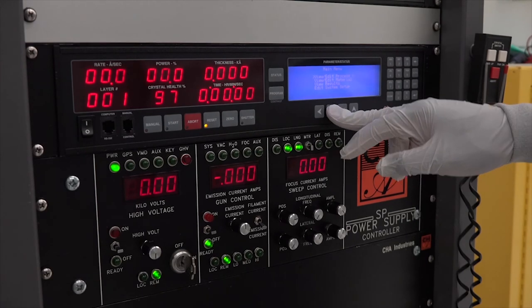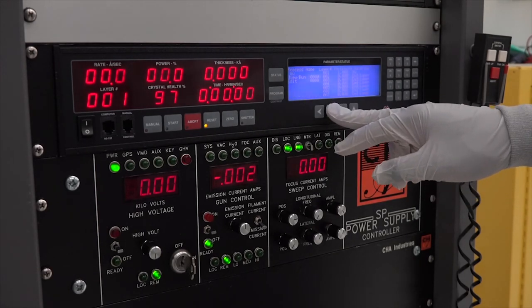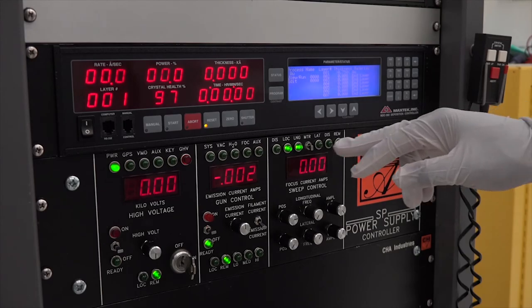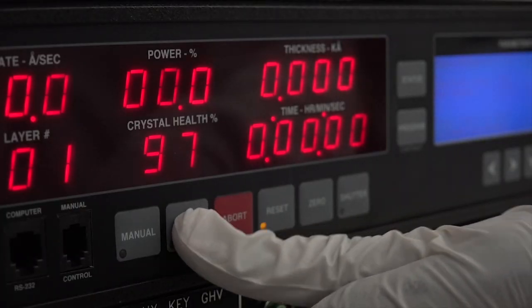We can now begin the e-beam deposition process. First, we select a recipe. This tells the computer which material or sequence of materials that we want to deposit. We then enter the desired thickness. Here we enter 75 nanometers, and then press the start button to begin the process.